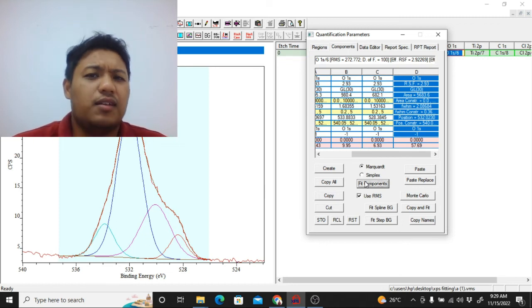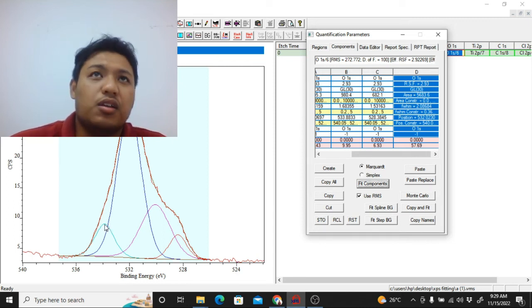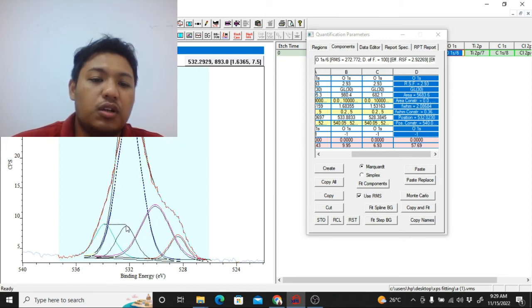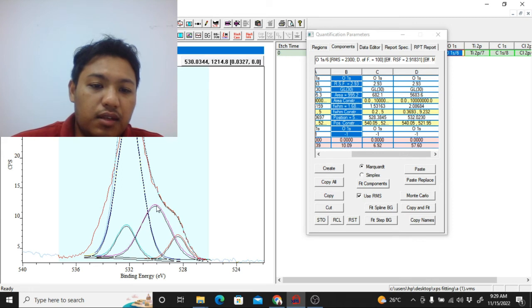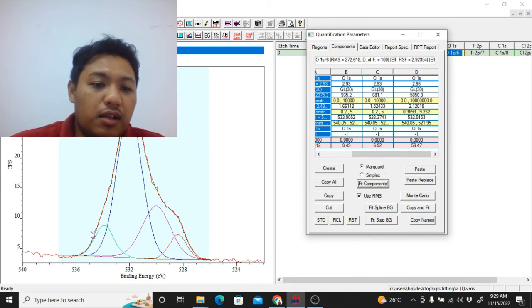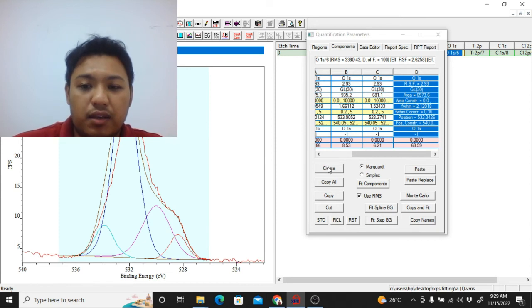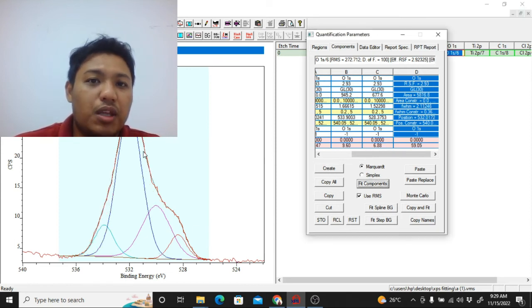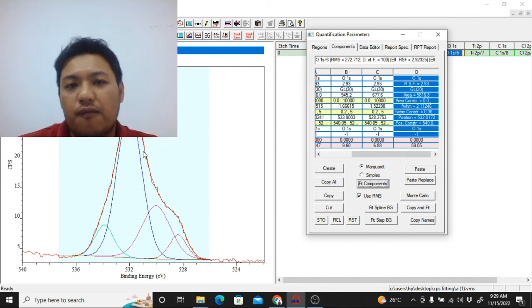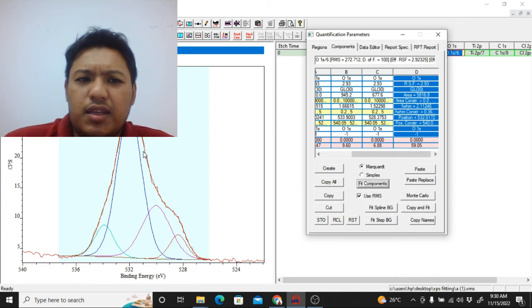The main important thing here is that you must know which binding energy, because you can still move the peak. For example, you read the literature and know this one is from 532, this one is from 530, and so on. And you must click fit the component. It is very important. And here what we call the envelope, you should not exceed the envelope. You can see here this is too far from the envelope. This is over the envelope, we don't want that, so be careful with that. It is very important. Make sure to minimize the distance between your peaks and the envelope, because the envelope will also be included in your analysis when you plot the data using Origin. Okay, I think that's all.